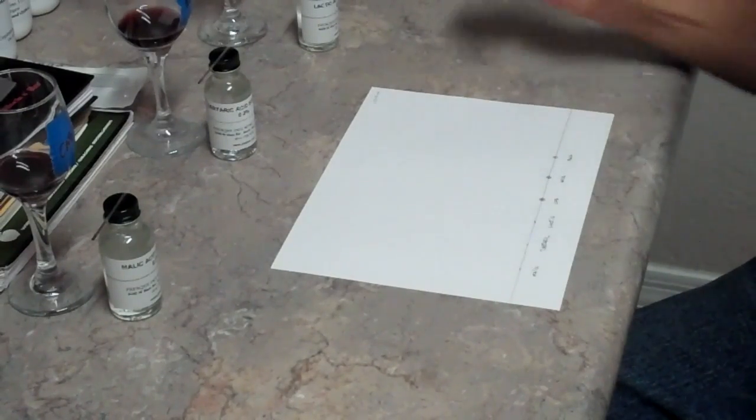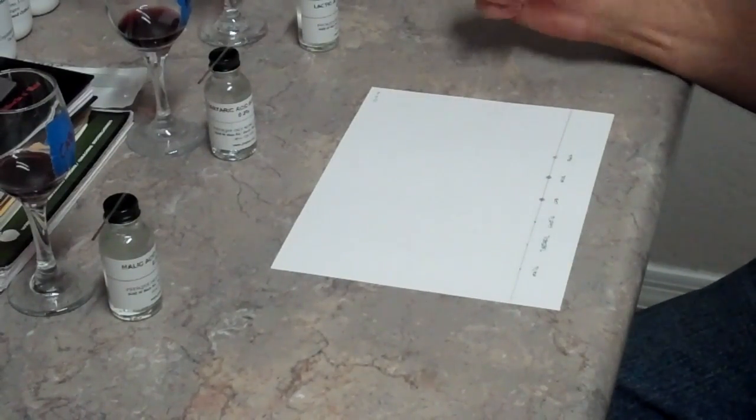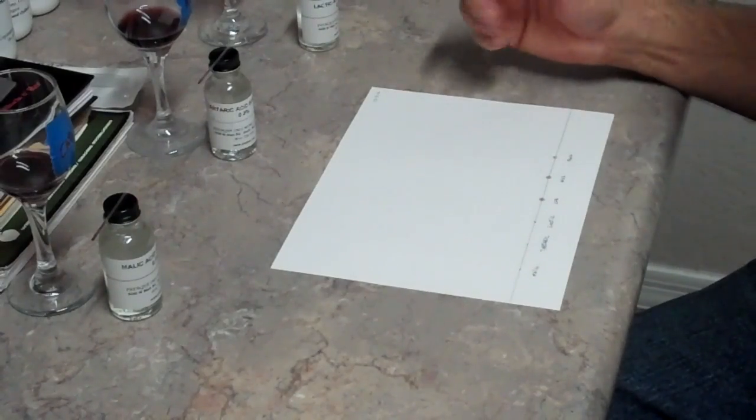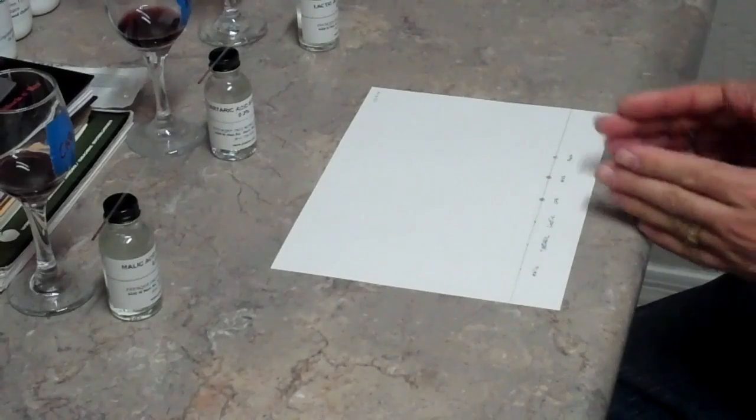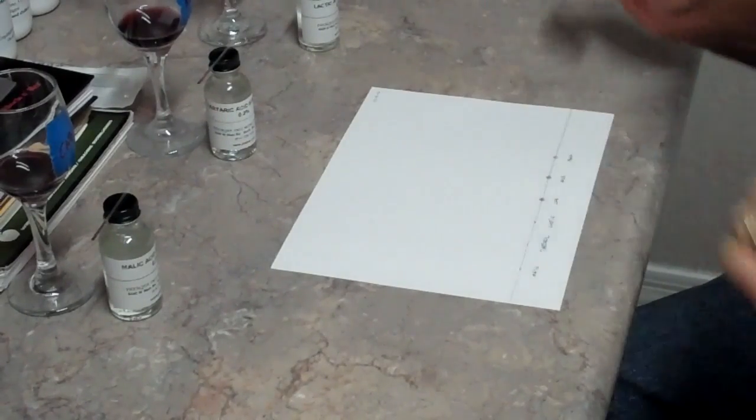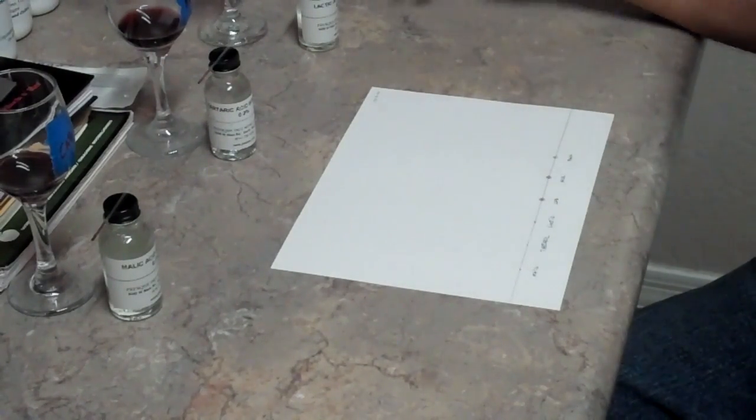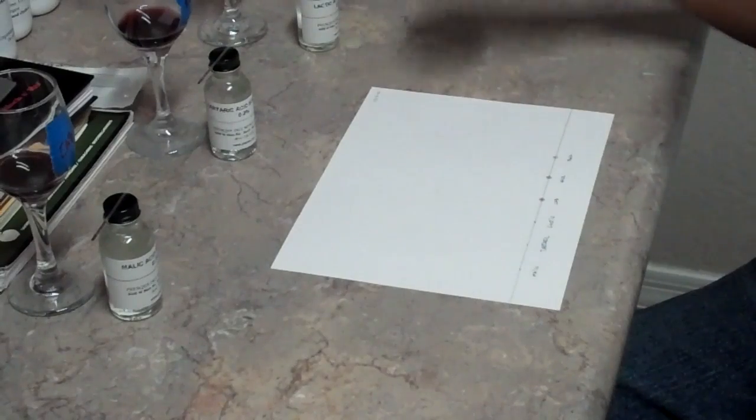We want to make sure that each time we dot it, we let it dry before we dot it again. Otherwise, our sample will get kind of large. What we don't want is for the two to run together. We want to keep them separated. This last one is our Barbera.